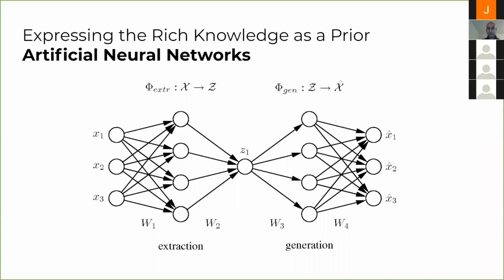The reason they have become so hyped up is mainly because they introduced this new approach that is called the data-driven approach. So if you have a lot of data, you can use neural networks to extract patterns out of your data that you can then apply in something like the reconstruction that we do.